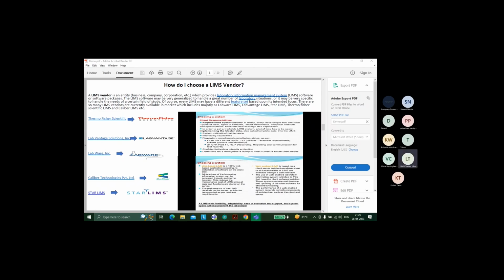So see, user friendliness, I cannot answer you, because to you, something can be user friendly. To me, something else can be user friendly. To you, Windows can be user friendly. But some programmer may come and tell that, okay, Linux is user friendly. But if we speak of user friendliness, it is something like, we click here, some other drop down comes and we understand where we are navigating. Things are not complicated. So much data is not asked. That way we can assess user friendliness. But if you ask me which is the most user friendly, that may differ from person to person. You got my answer, right? Yeah, correct. Because someone can tell this software is user friendly for me. Someone else can tell, no, this is not user friendly. That is user friendly for me.